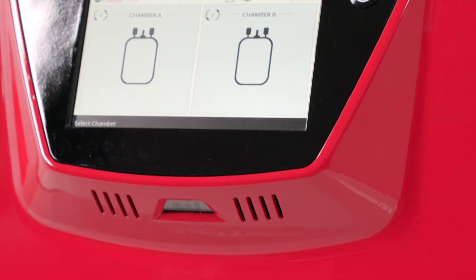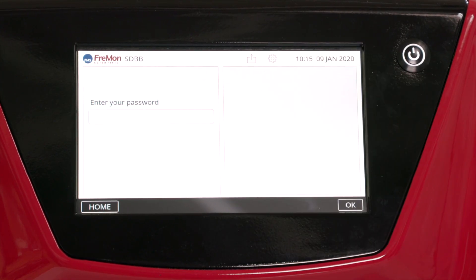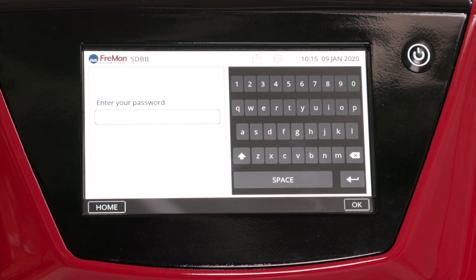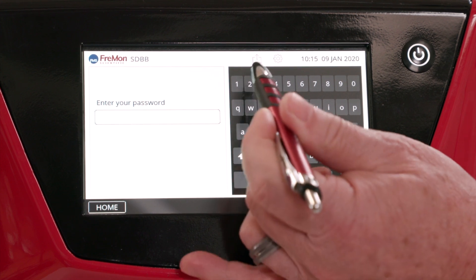The first time you use Zipthaw, you'll need to set up the device. Press Settings. Enter the admin password. The default is in your user manual.